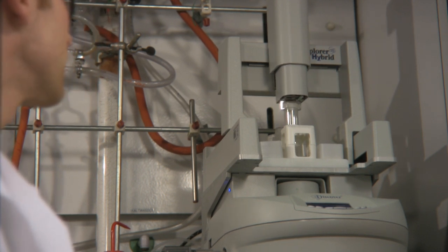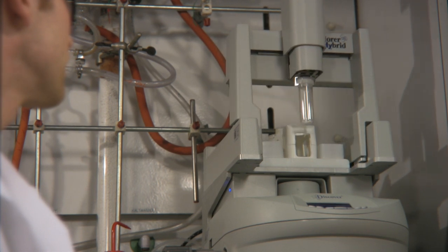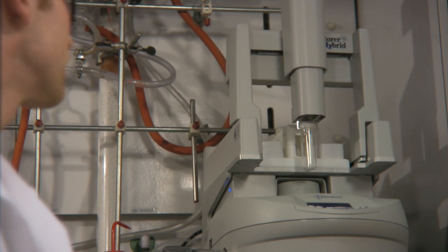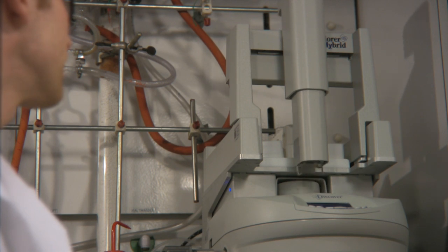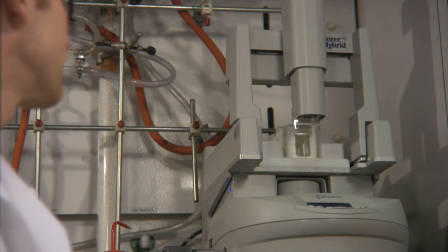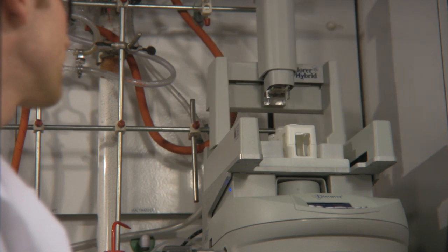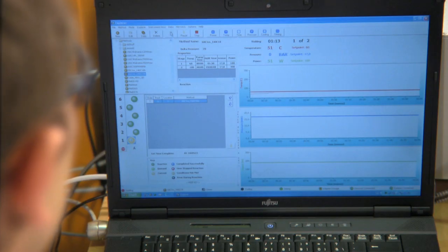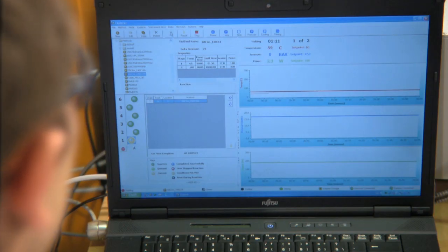Control over reaction temperature, heating rate, pressure, and by using standardised reaction vessels allows for a reproducible synthesis. All parameters are digitally detected and recorded.